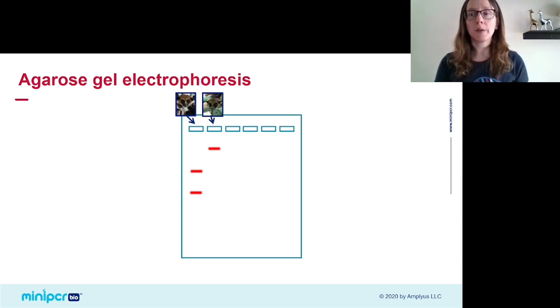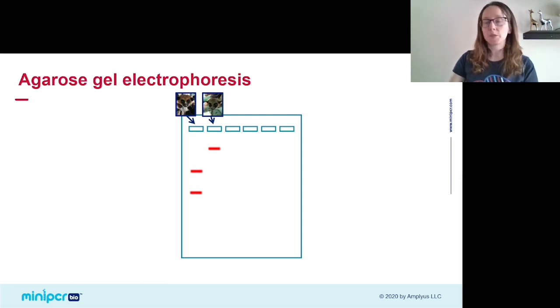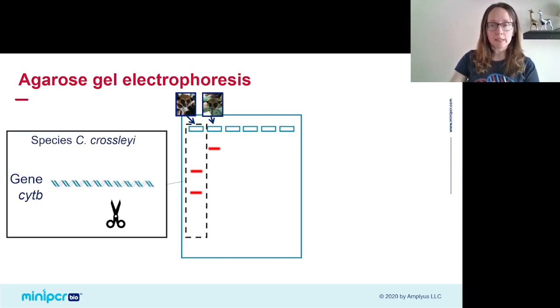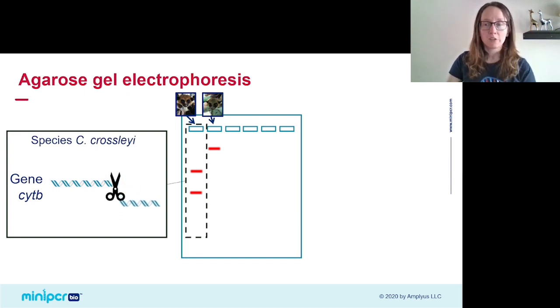Let's carry this all back to our experiment. We're running DNA from our two lemurs in this gel. The one on the left we know is from the species C. crossleyi, and the one on the right is our mystery lemur. Let's first look at the sample from our first lemur. We see two bands in this sample, which means the sample was composed of two differently sized segments of DNA. This is consistent with what we expected to see for C. crossleyi, because we know our restriction enzyme cuts the C. crossleyi gene for Cyt B, generating two differently sized fragments.